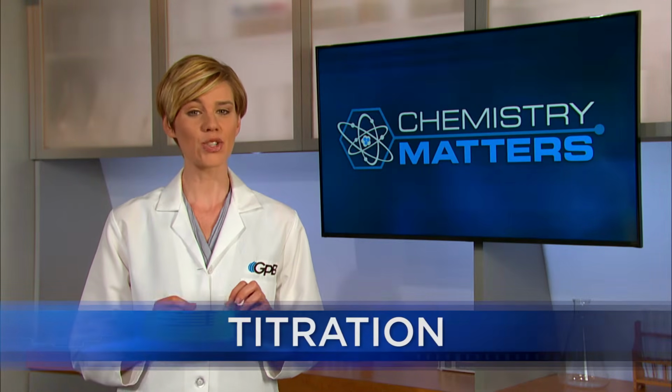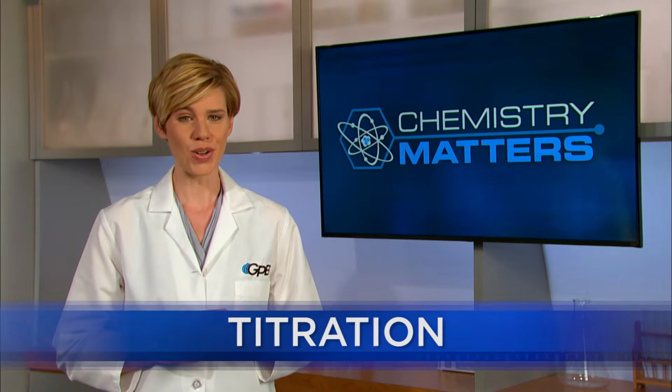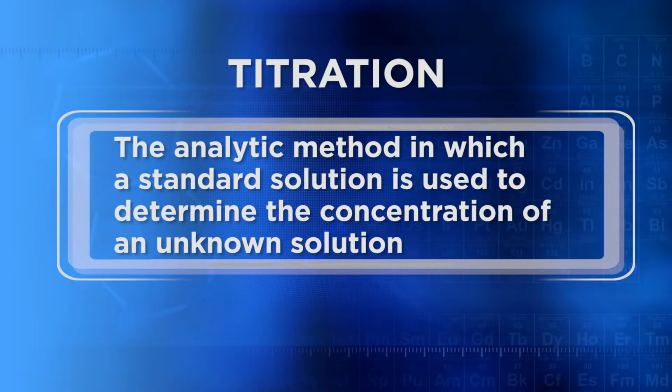We can also use neutralization reactions to our advantage in a chemistry lab. If neutralization is done under carefully controlled conditions, we can use a technique called titration to determine the exact concentration of unknown solutions. Titration is the analytic method in which a standard solution is used to determine the concentration of an unknown solution. How can titration be useful?